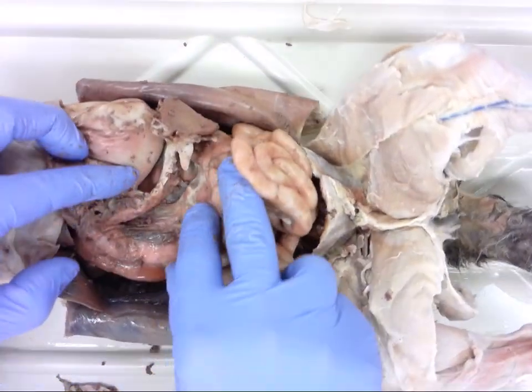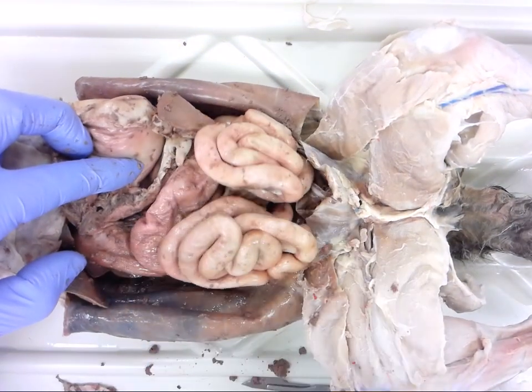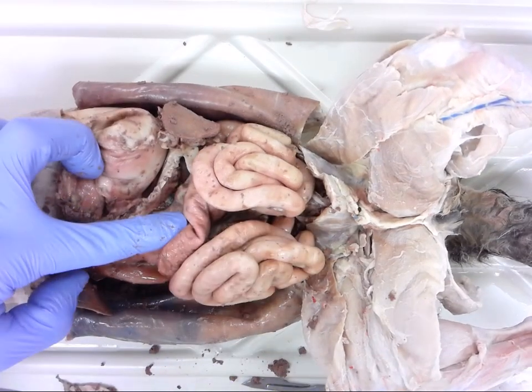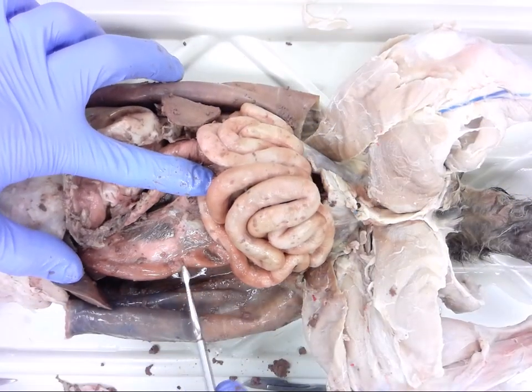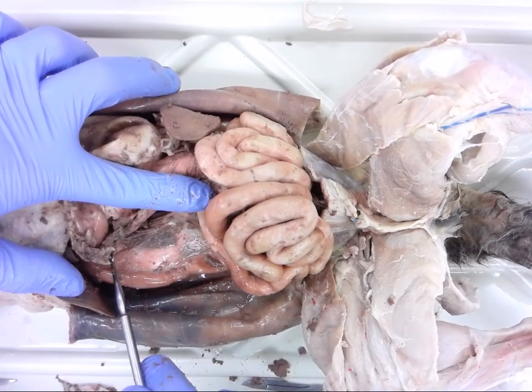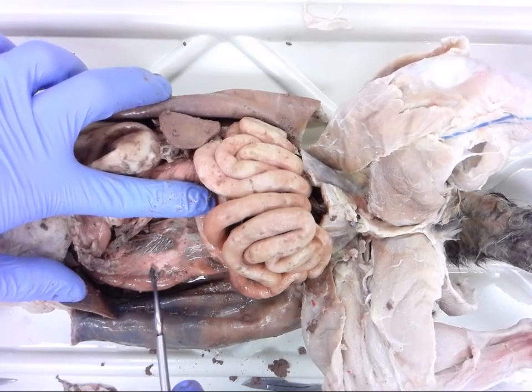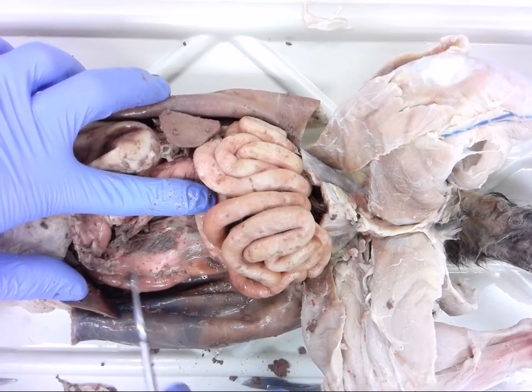So right in, if I can get a good view on the camera there, the small intestine is this structure right here. We can move this out of the way a little bit. This structure here is the first part of the small intestine, and right beside it we have the pancreas. And the pancreas is C-shaped. It follows along that intestine, and it varies in color from one to the other. This one's sort of pinkish.